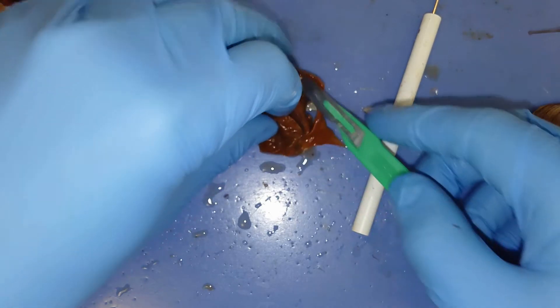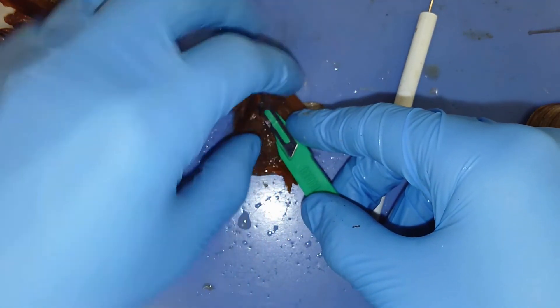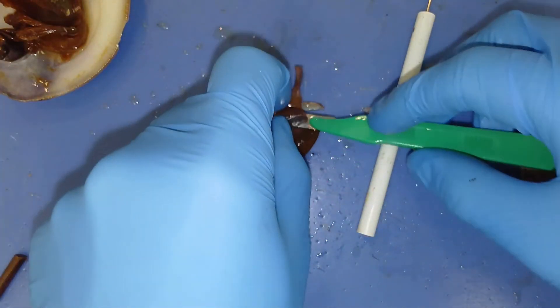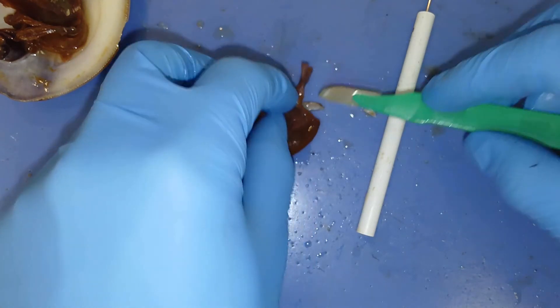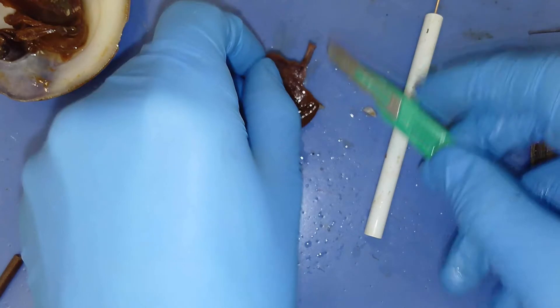We're just going to take a cross section of this individual and look at the entire inside of the visceral mass. The visceral mass is just acting like a sac to hold all the organs, such as the digestive gland, the intestine, and the gonads.